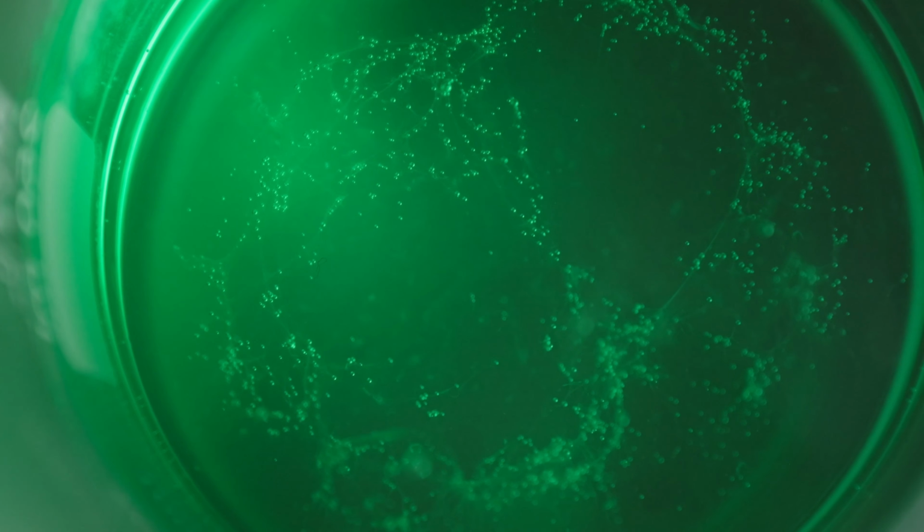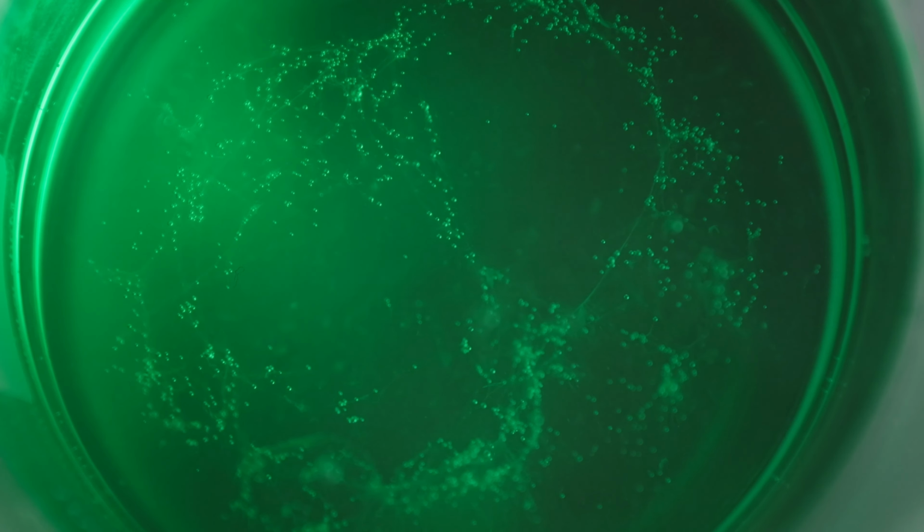Now after a few minutes, you should be able to see DNA floating around in the liquid mixture. An individual DNA strand is hard to see with our naked eye. We will need a high-powered microscope to be able to see it, but we can see them with our naked eye when they clump together.